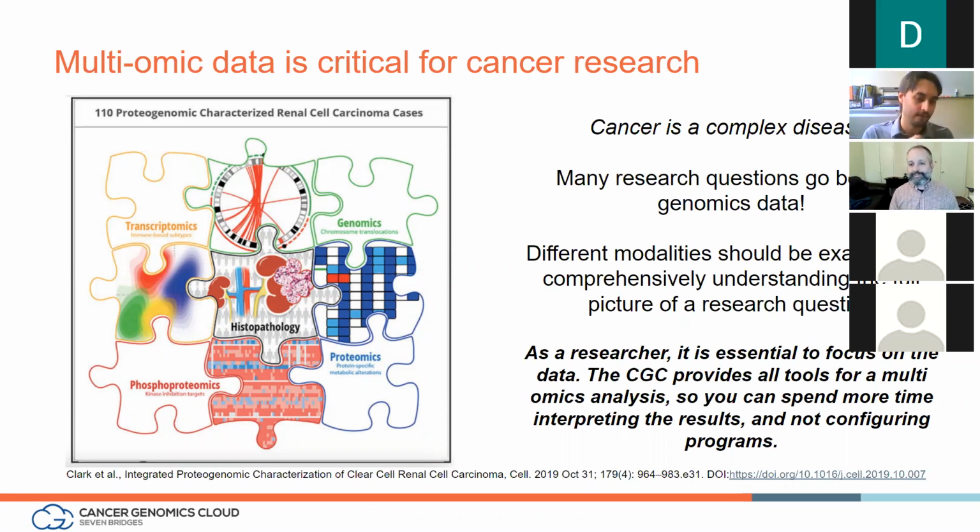Yeah, so as a final point, the message that we want to give is that the way things are moving today is towards a multi-omics or an integration aspect. So the idea is now to face and interpret these different biological and complex conditions like cancer or other biological phenomena by integrating different omics or different technologies.